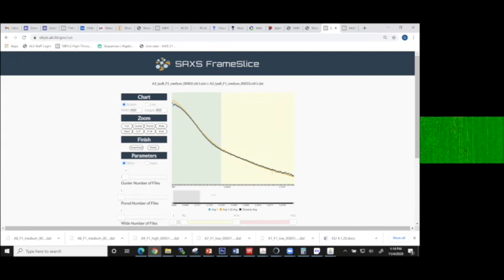In this particular case, you can see that even in the high Q, there's a bump out here that you want to preserve. If you get rid of it by using all the curves, you're going to lose features in your data, some resolution. So you want to preserve those little bumps and wiggles. So I'm going to go for 4 here, and if I go too drastic, in this intermediate region, you can see I've developed a step function. Let's see here.